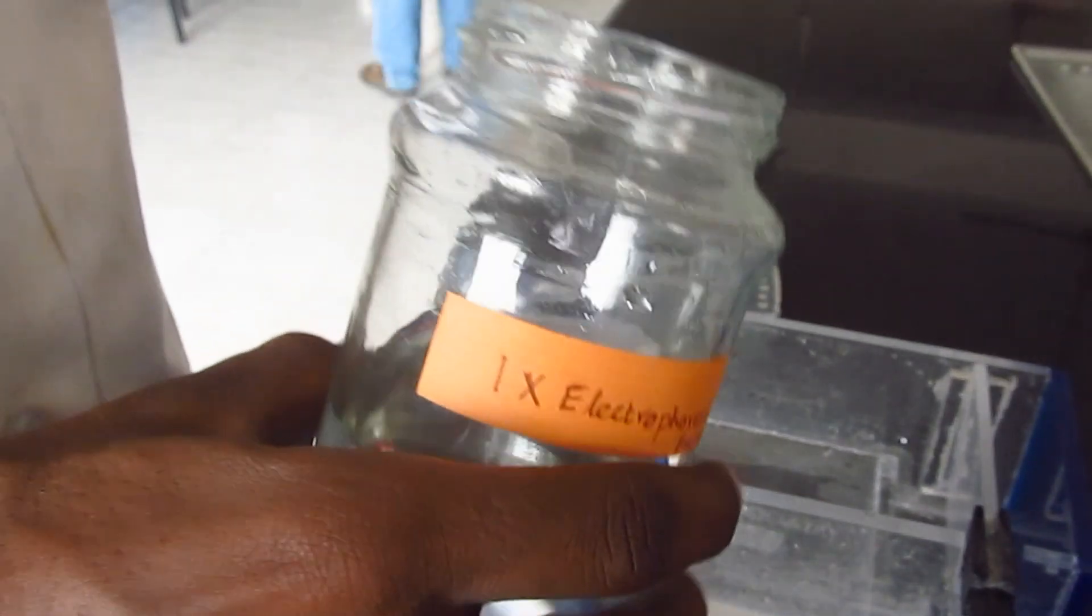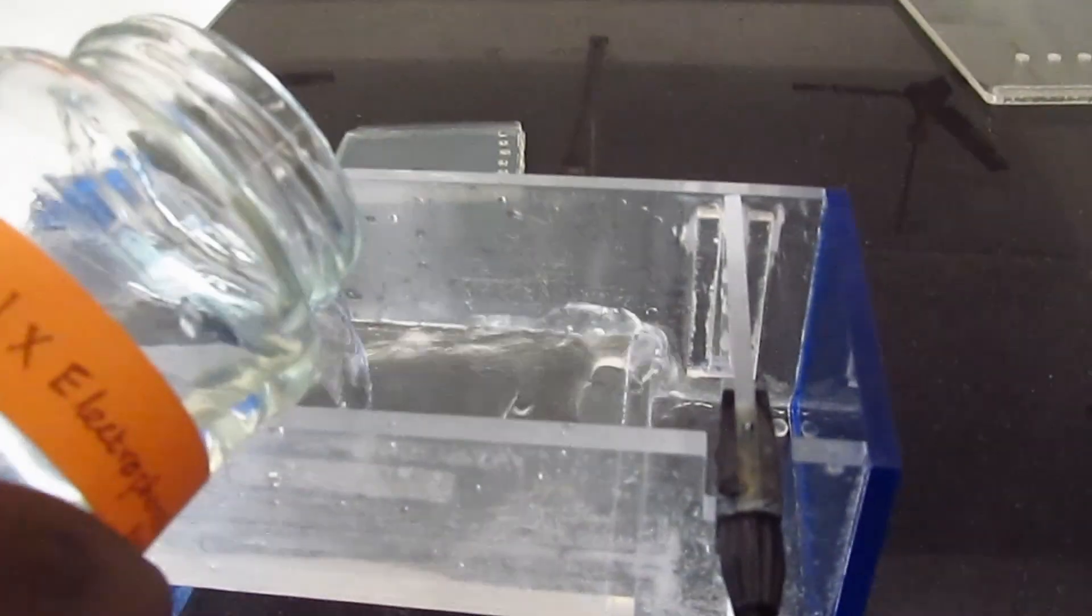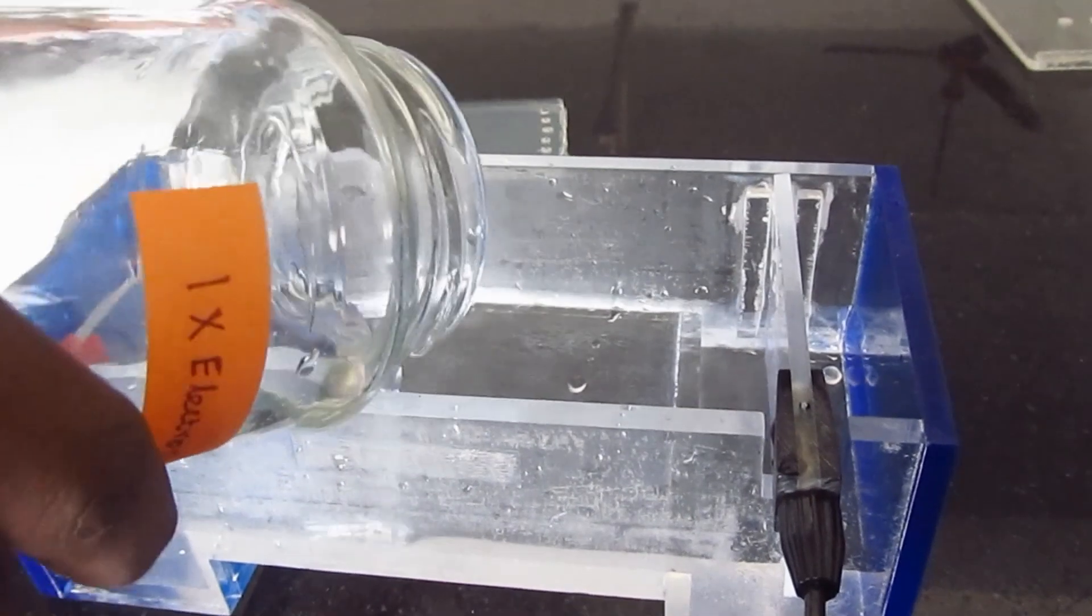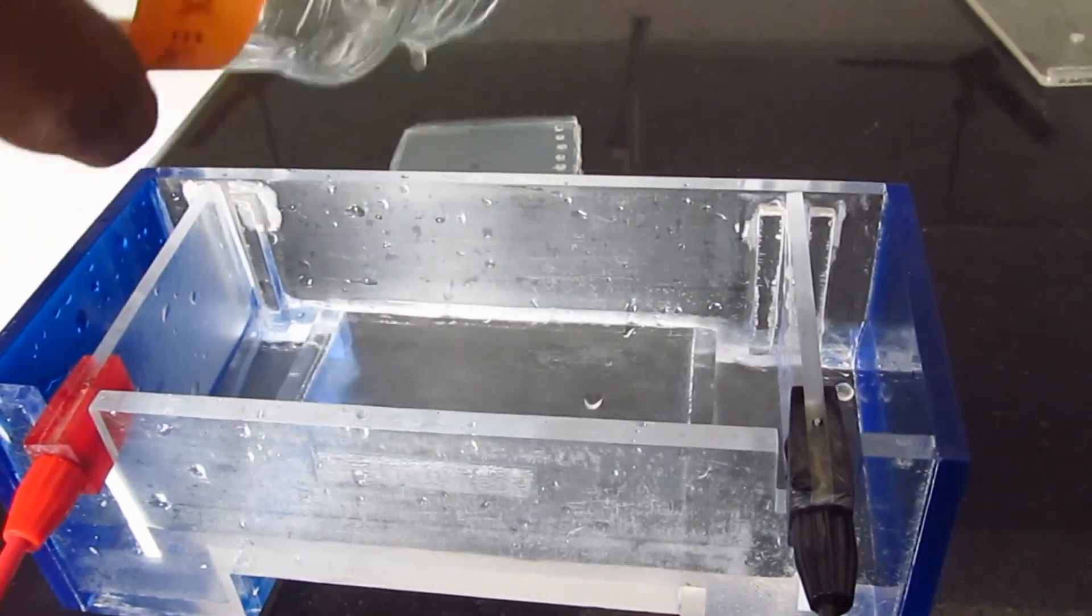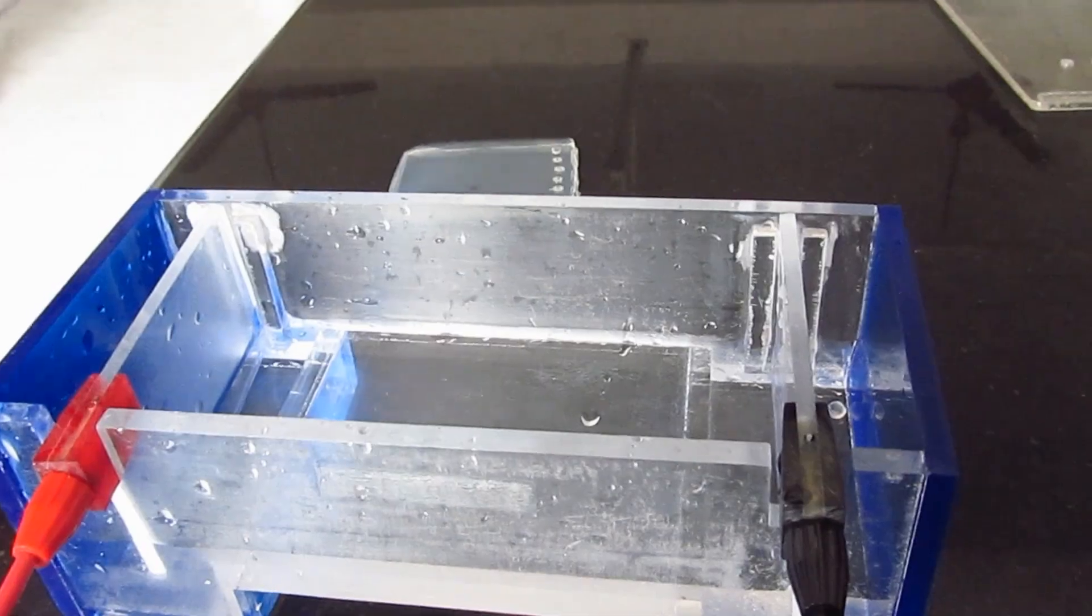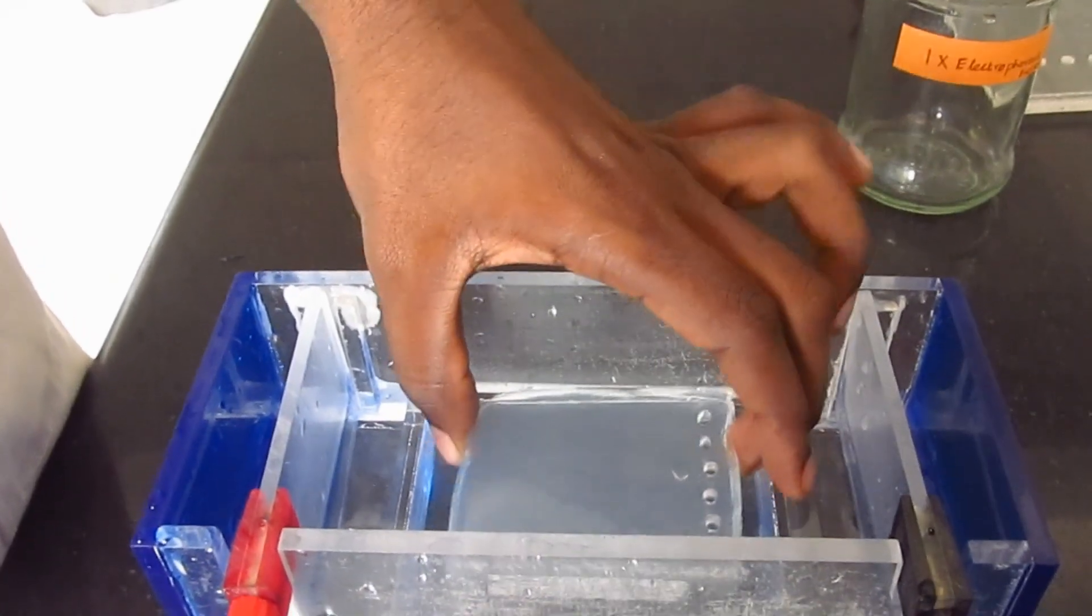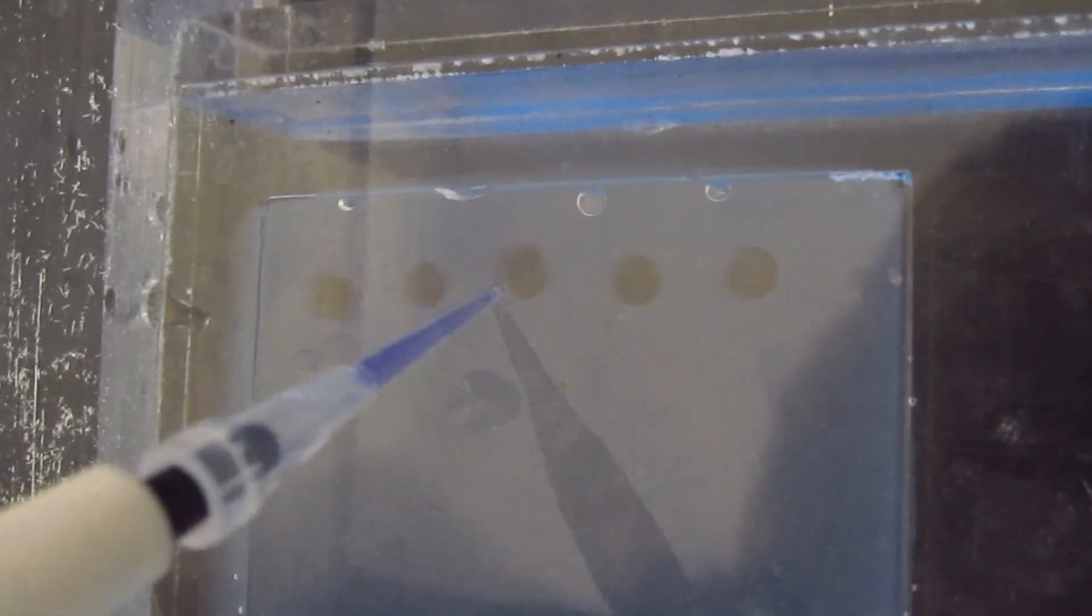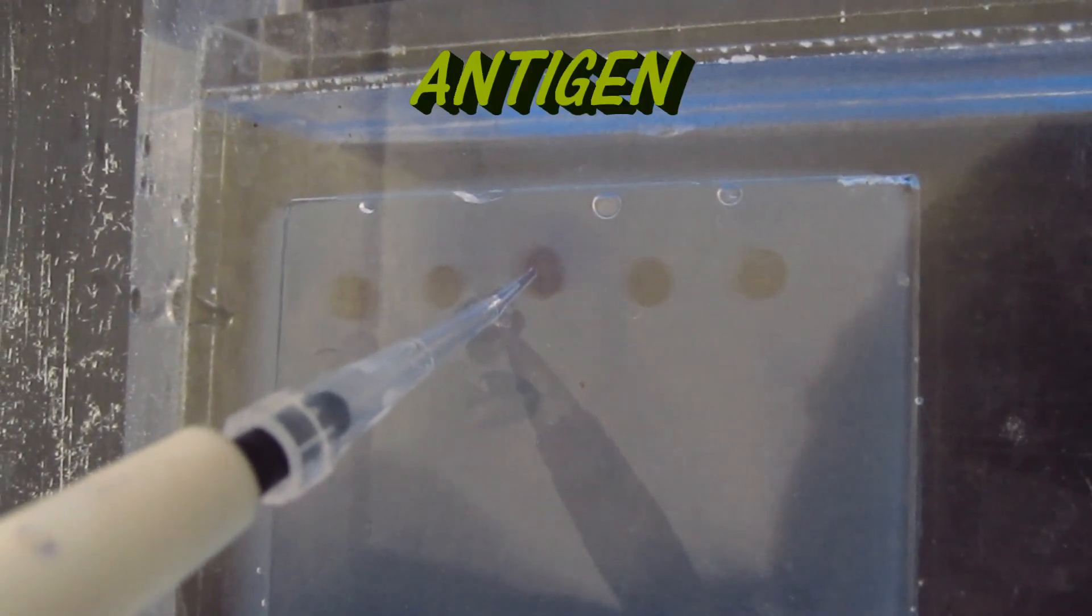Pour the 1x electrophoresis buffer into the gel tank. Immerse the gel into the buffer. Load the antigens into the wells.